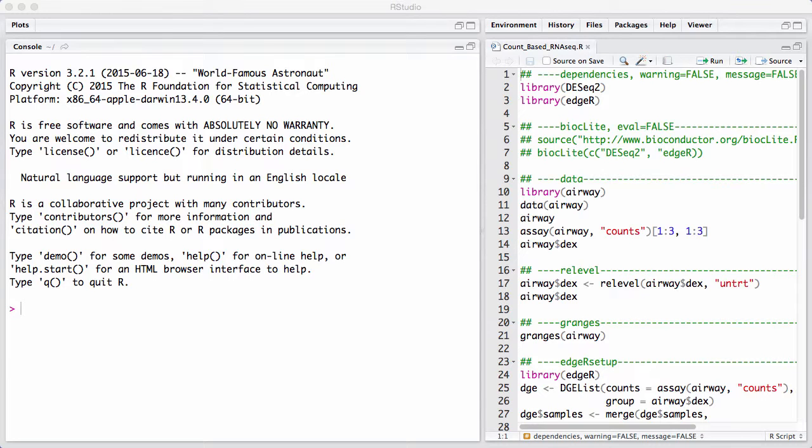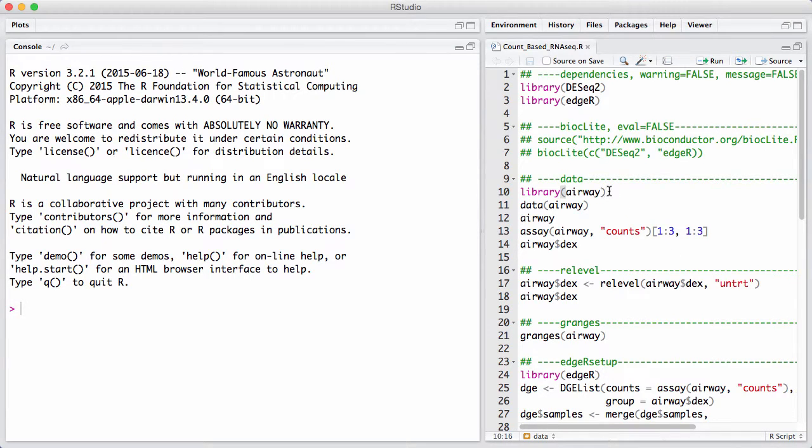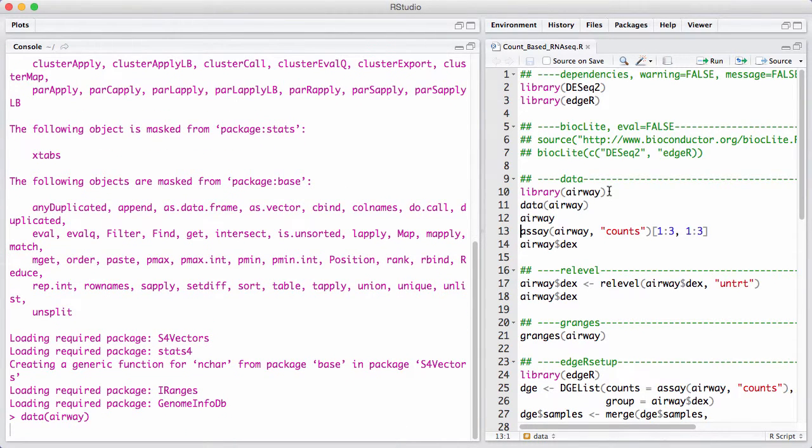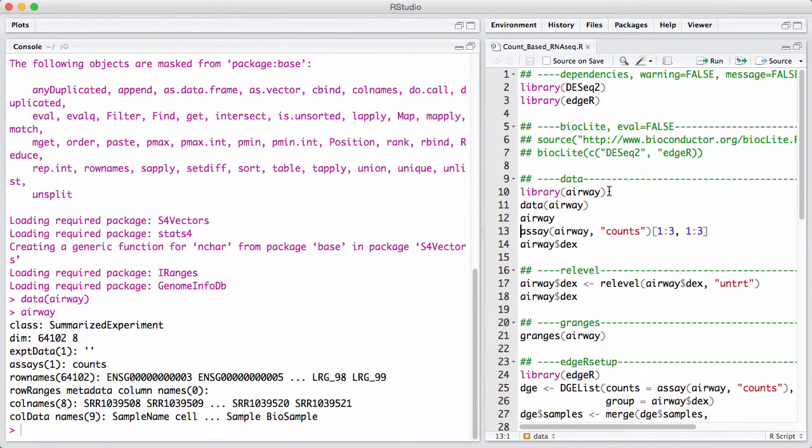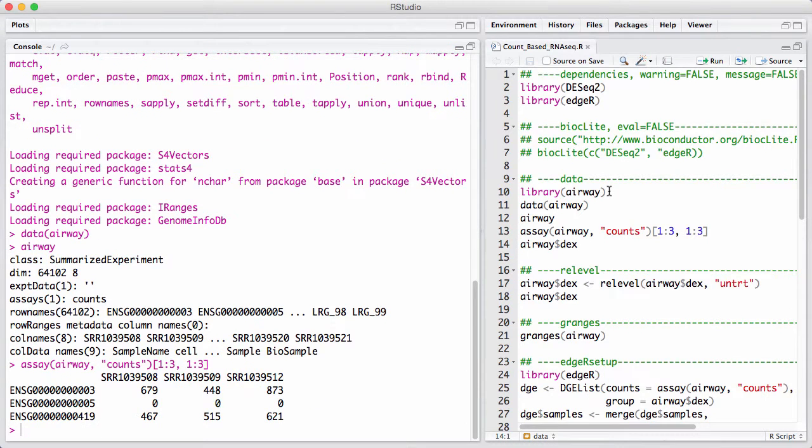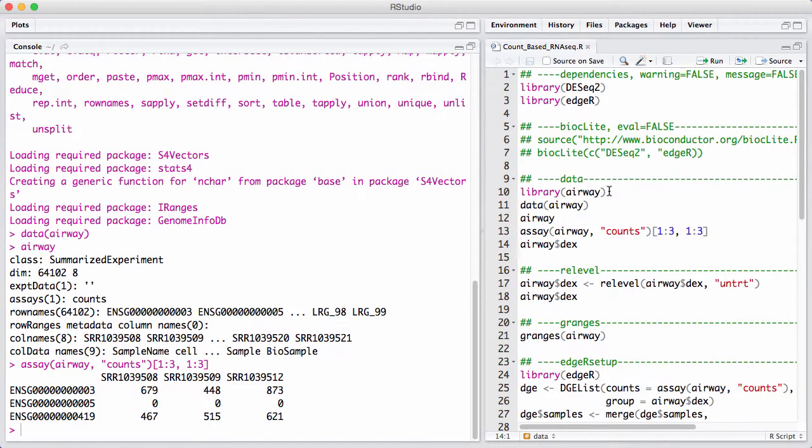Let's take an example dataset, the airway package, and see how that data looks like. This is naturally stored in a summarized experiment. Here we can see that we have eight different samples and we have 64,000 different features. We have integer counts inside of the features, and that tells us something about the expression level. This is completely unnormalized data.